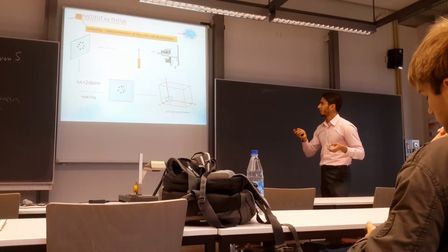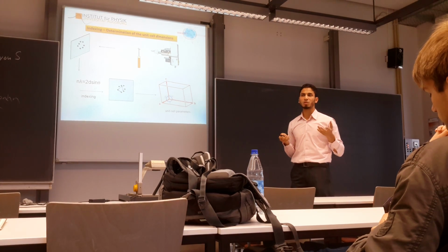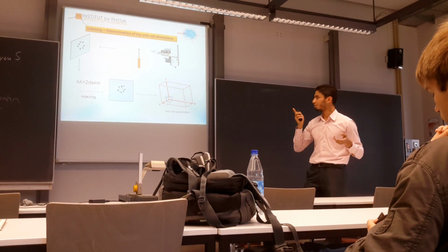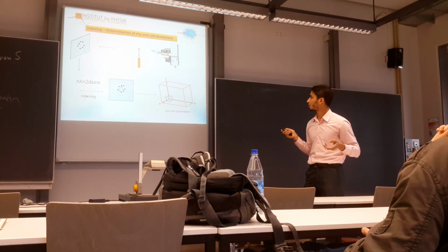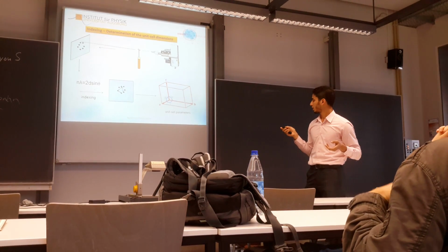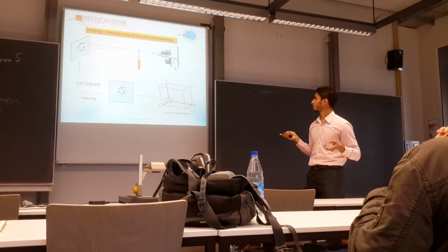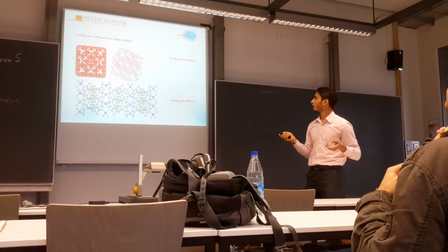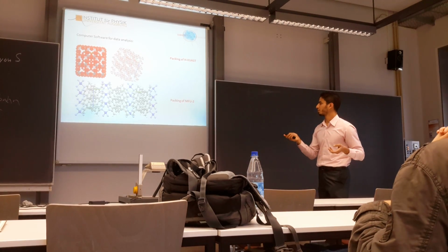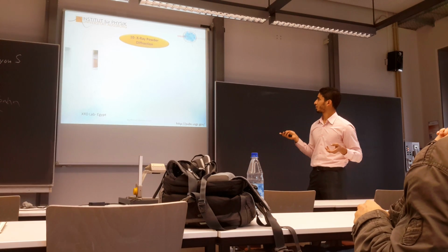After choosing and preparing the material for measurement, which is a little bit time consuming in comparison with X-ray powder diffraction, and I will illustrate it now, you should adjust the position of the crystal in the way of the X-ray. Then the measurement takes place. And you can do analysis of the data by using computer software, and you can determine the packing and unit cell of the material.